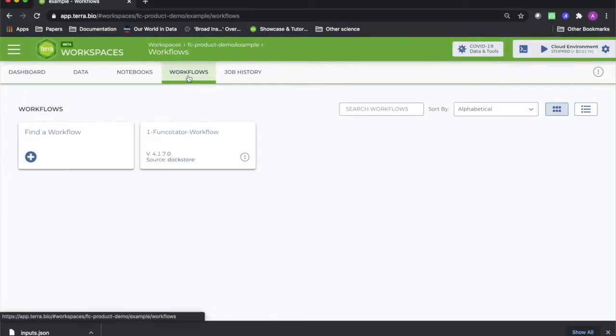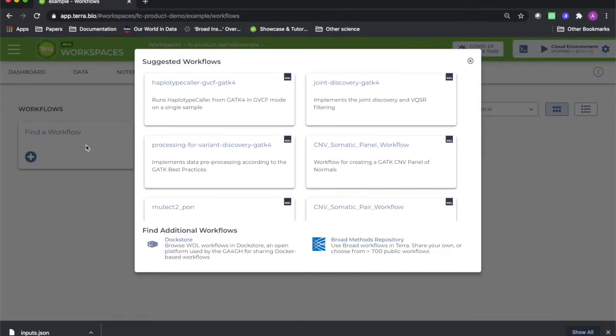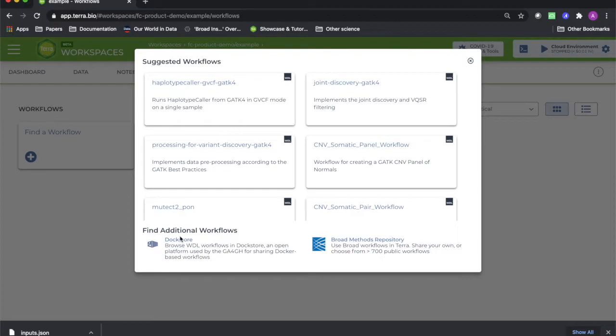When you're in a workspace to which you have owner or writer access, you can also import additional workflows by clicking on the Find a Workflow button under the Workflows tab. This will bring up a window with a set of suggested workflows that are ready to run from within Terra.